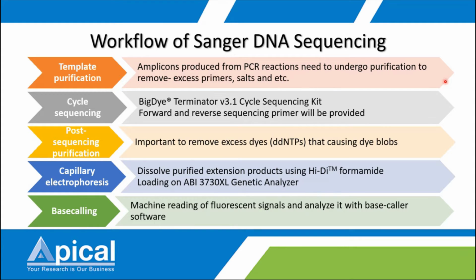So what about plasmid samples? Do you need to perform any purification for your plasmid sample? The answer is actually no, because when you perform plasmid isolation from the host cell, it means you have taken out the pure circular double-stranded DNA, which is the plasmid, from the host. The plasmid should be pure when you isolate it using a commercial kit. So for plasmid, there is no need to perform any purification.